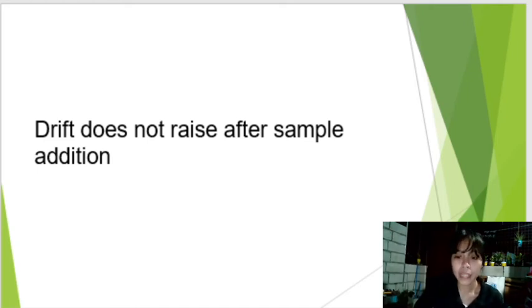So, pwede po tayong gumamit ng mga reagent na pasok po dun sa sample or pwede po tayong gumamit ng catholyte. For that, ang gagawin po natin na troubleshooting is pwede po nating palitan yung reagent, pwede po nating fill up or palitan yung catholyte, and i-check yung electrodes.